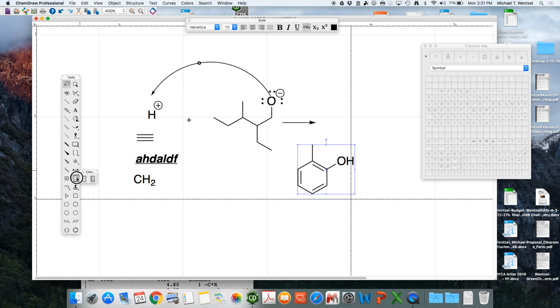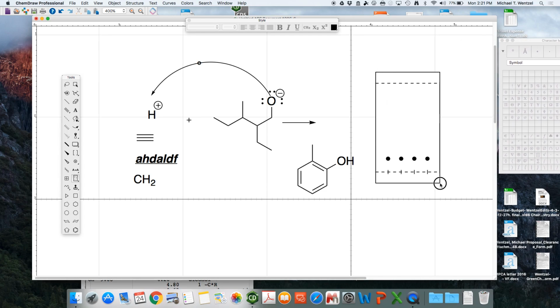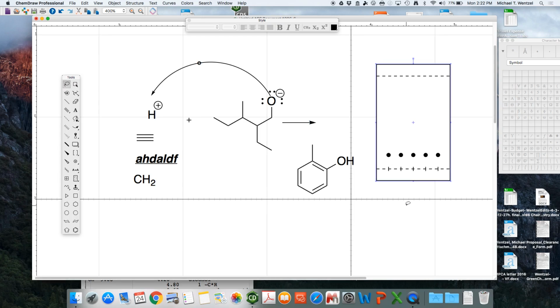So if you click here, click on this guy, right? You can actually make a TLC plate. Now with this, you can even change. You should be able to select this, and look, as you move it, it automatically is calculating your Rf for you. If you click on this lane and right-click, you can delete a spot.